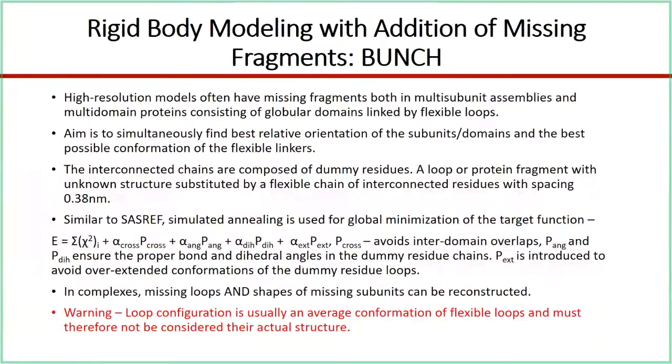One caveat for this is loop conformation. This is basically an average and a very approximate picture of what it can be to fit the SAXS data. It should therefore not be considered an actual structure.